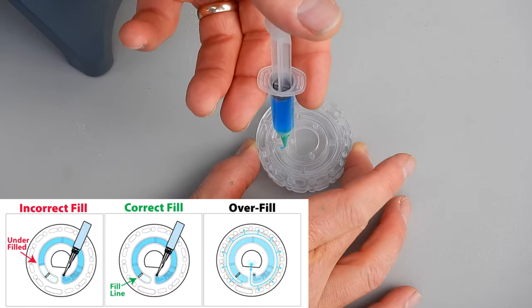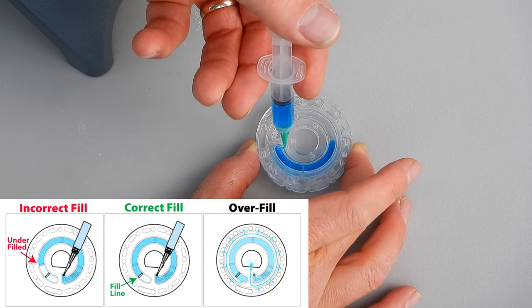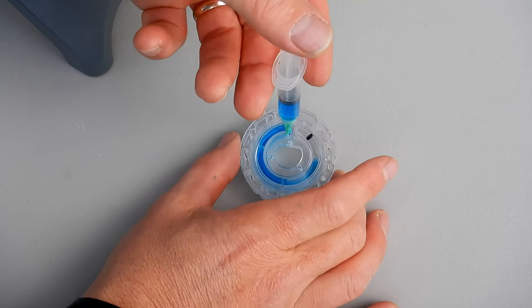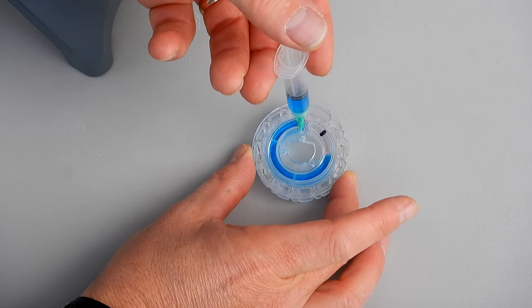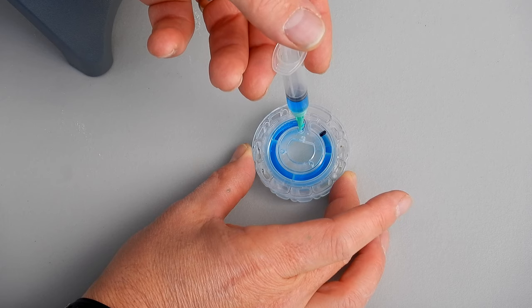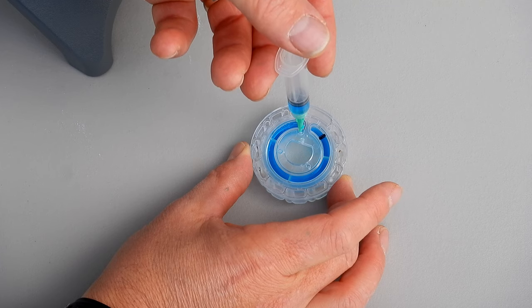Push down and you're going to see the blue food coloring enter the chamber. You can see it's getting close to the fill line, filling up the chamber. Look at the top — you'll see the water and make sure that it reaches that line on the top part.